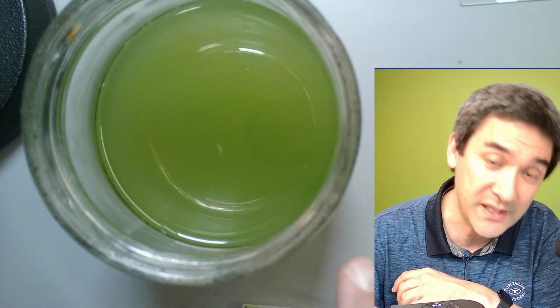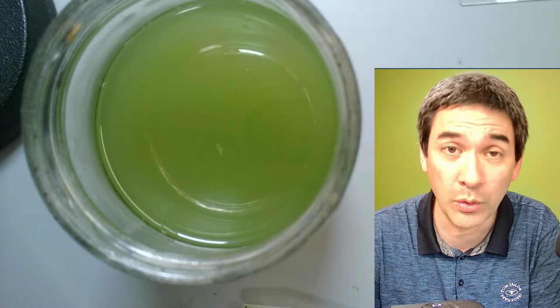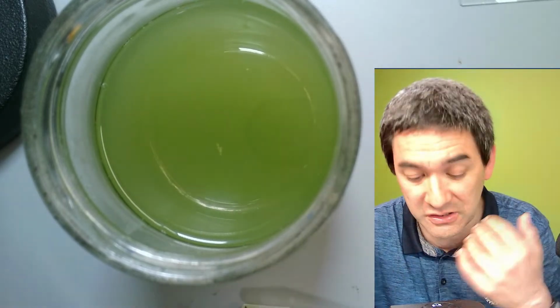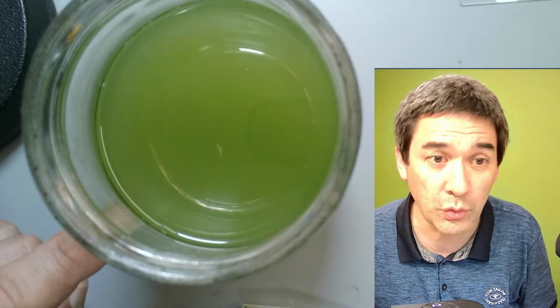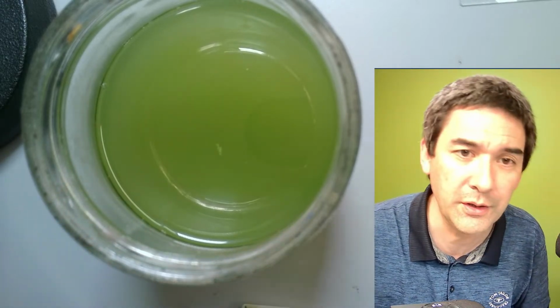This water sample I kept open. I always added more water when it evaporated. I just didn't feel like putting on a lid, and I said, who cares? I can always add a little bit of water, right? And this is what I have done. There are ostracods in here, floating around, swimming around in here.